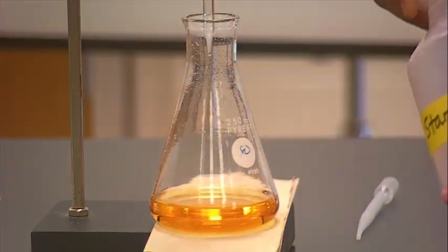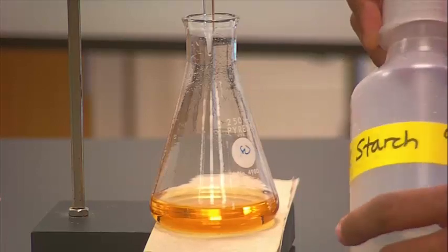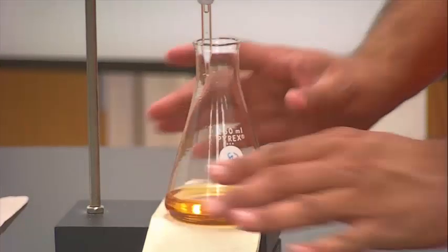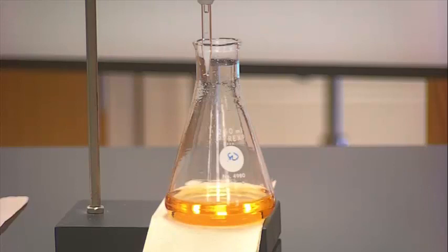Now I will add some drops of starch. All right, I've added my drops of starch. I just went ahead and added some extra drops. The protocol called for 40 drops, so I went ahead and put in 40 drops of the starch. Let us go drop by drop.